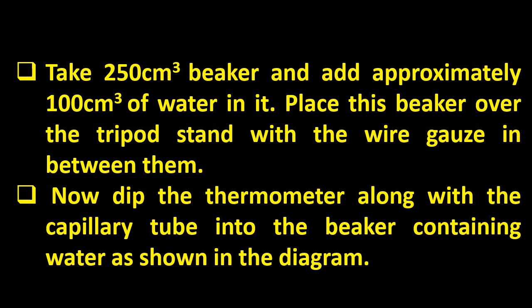Take a beaker, preferably of 250 ml capacity, and add water in it. Place this beaker over the tripod stand with the wire gauge in between them. We use a tripod stand because we have to dip the thermometer in the beaker. We put the beaker at some height so that it can accommodate the thermometer. Wire gauge, being made of iron, can equalize the heat. Then dip the thermometer along with the capillary tube into the beaker containing water.